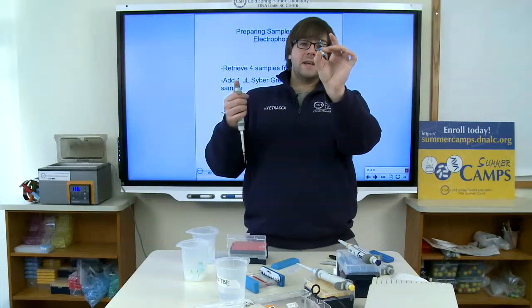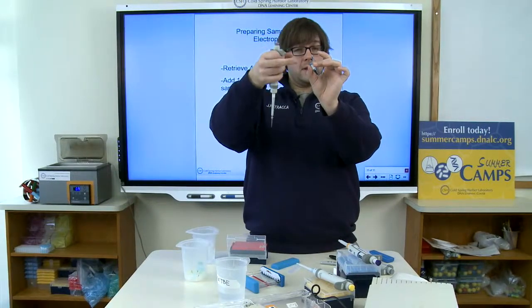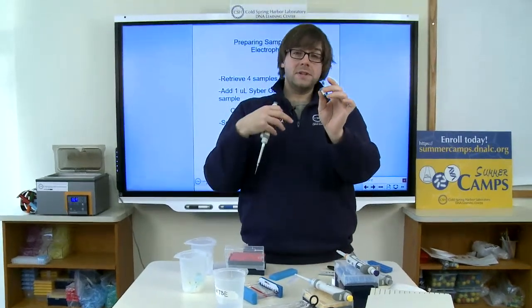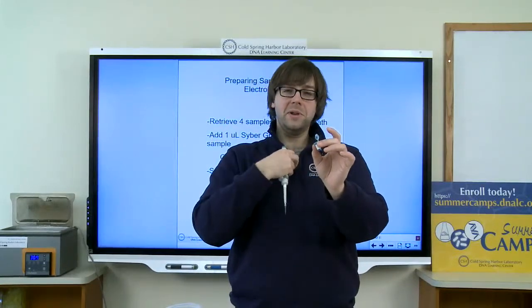I'm going to take my SYBR Green tube, and by the way, SYBR Green is pretty viscous and nasty, so when you're working with this, you want to be careful. If it gets on your clothes, it'll damage your clothes, and if it stays on your skin, you're going to be blue for a while. But that's why I wear blue.